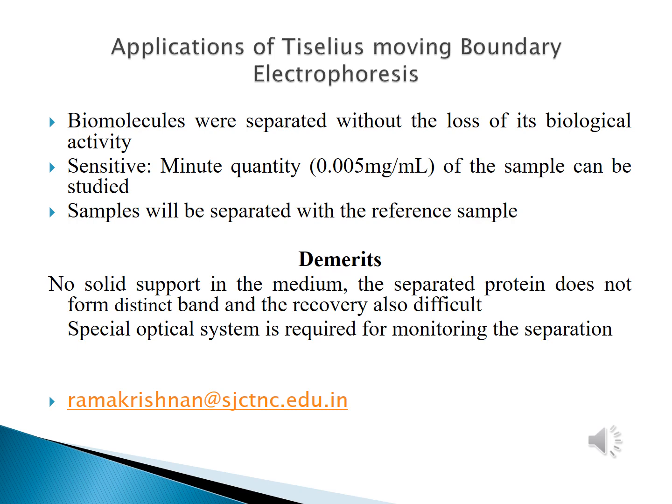The demerit of this system is that the protein or any compound separated is not in a distinct separating medium. Therefore, recovery is very difficult. Additionally, it requires a separate monitoring system such as the Rayleigh interferometric system or the Schlieren optical system.